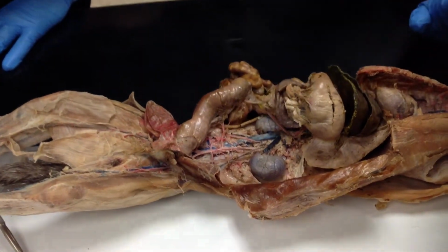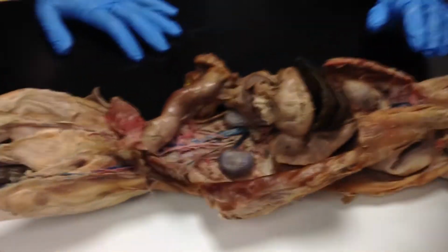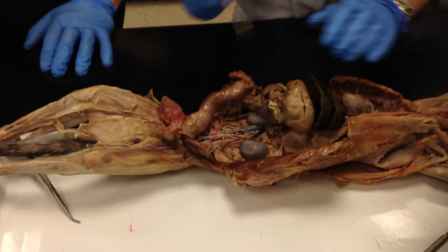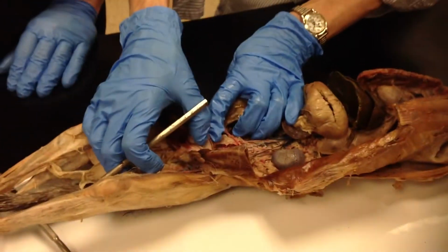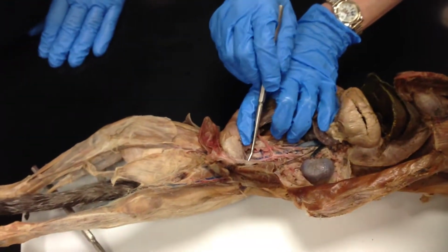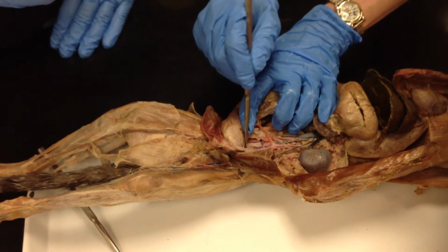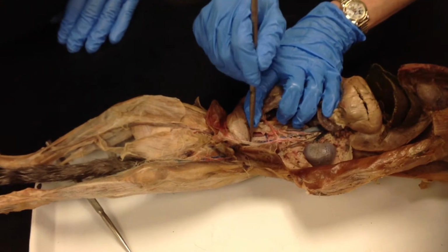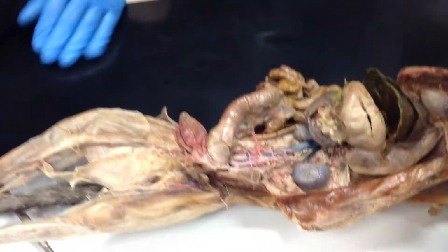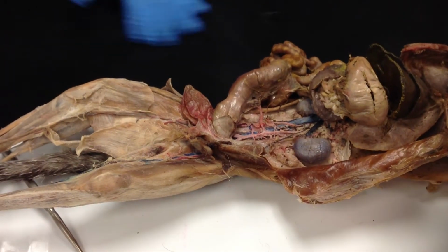Then if we look at our arteries, if we come down here to the main branch of our arteries, you're going to have a big V, and then below it you're going to have a little v. So this is the external and internal iliac arteries. And that's been ripped. Okay. Well, here's a big V for your external, and that's part of your internals. And then there's this little one that should be going in the middle. I'm not sure what that is. Maybe that's it. Probably. That's the caudal. So you have a big V for your external, and you have a smaller v that's your internal, and then right in the middle running down is the caudal artery for the tail.